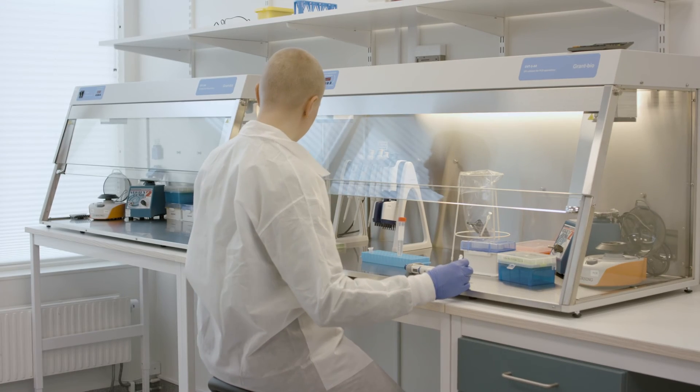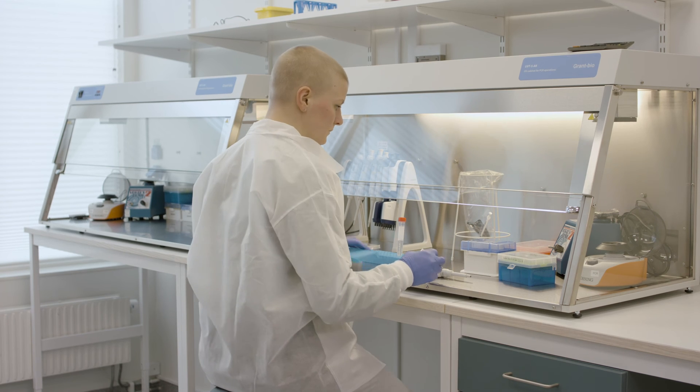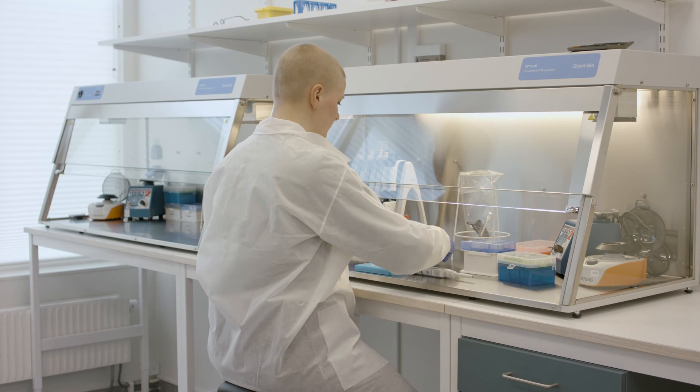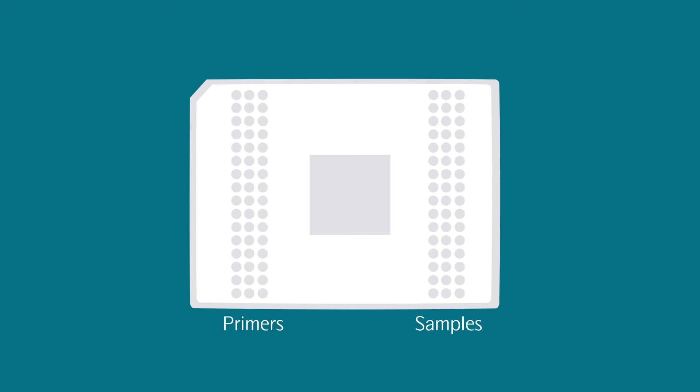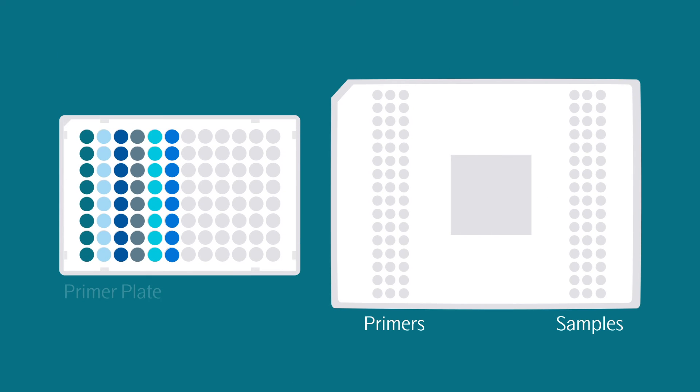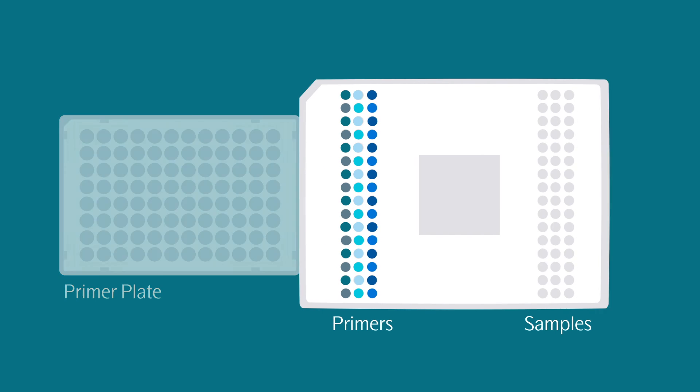The next step involves loading the primers and samples onto the Olink 4848 IFC. Using reverse pipetting, pipette 5 microliters of each primer into the respective primer inlets on the IFC on the left-hand side.